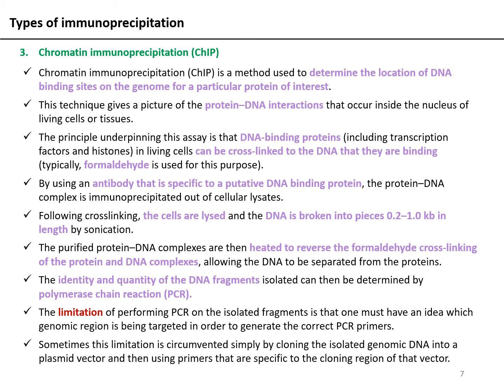So yes, it is quite natural if you are doing some experiment for the first time and say for instance you have a novel protein. You know it binds to the genomic DNA, but obviously you have no idea where it binds. Then how will you go about it? You want to identify this DNA fragment where it binds.